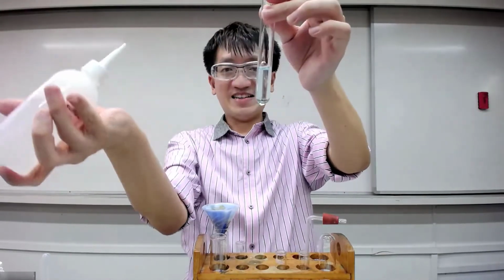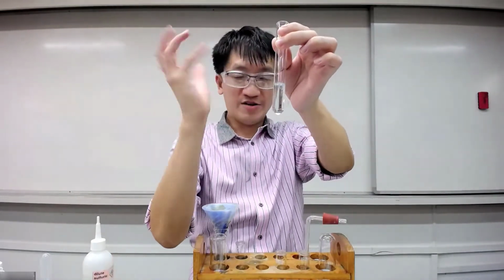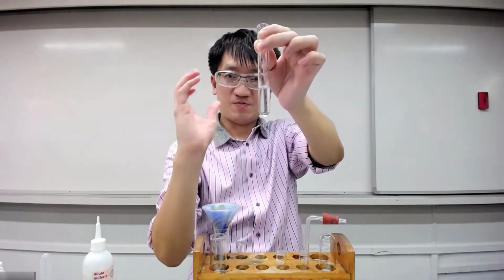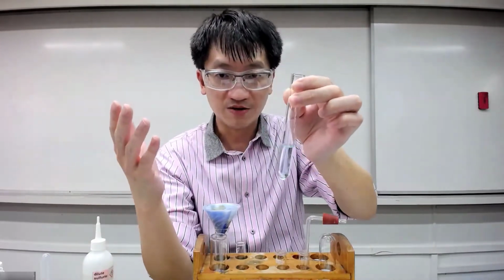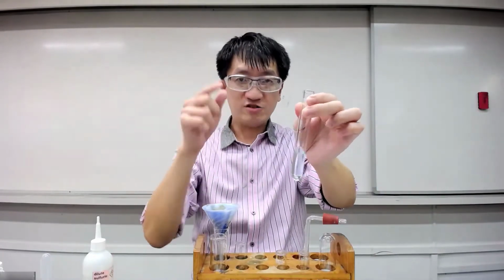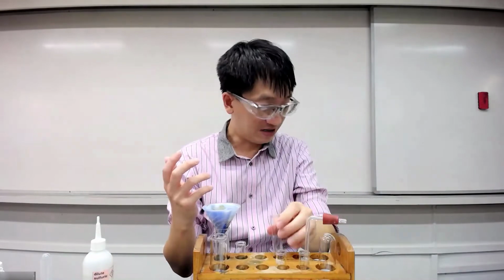Yeah, you don't see anything, right? It's like a magic show. Straight away, the spiraling dark blue solution just spirals off and gives you a solution. That's what you observe. You don't see the pale blue precipitate. So always remember to add dropwise. So that is the part, I hope you can remember it.